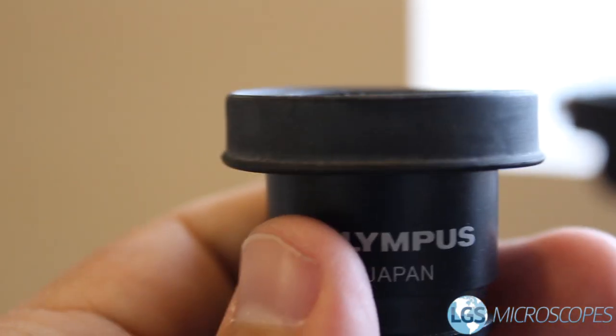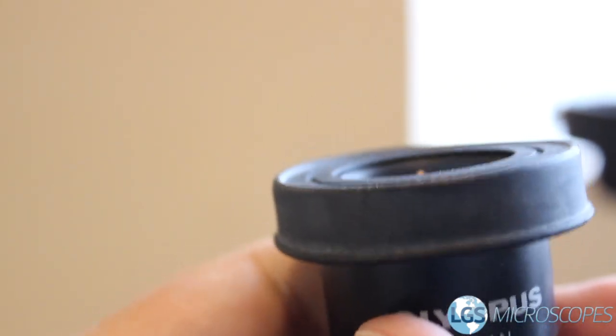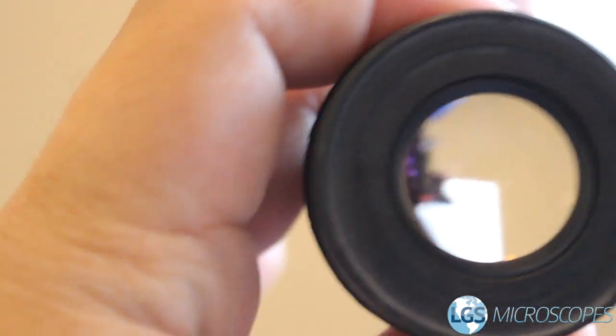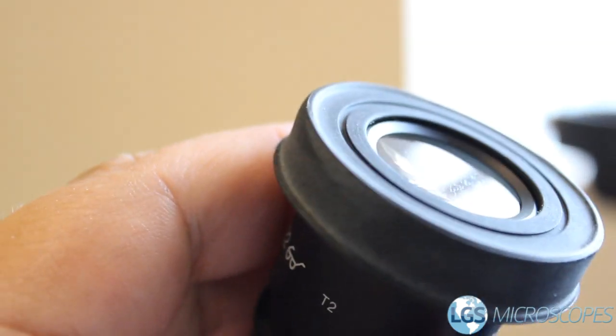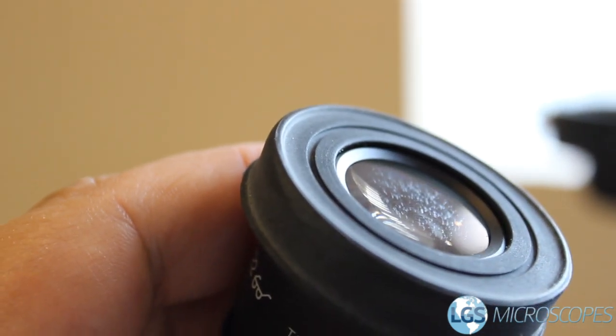Now that you've got the bulk of the dust off of the body of the microscope it's time to move on to the eyepieces. On this microscope you can pull the eyepieces out, and so that's what I've done here. If yours can do that you should try that as well — just be careful not to drop them. When you look straight down it doesn't really look that dirty, but the trick is to use the light to your advantage. Angle it from the light and now you can see all that dirt and grime really starts to stand out.